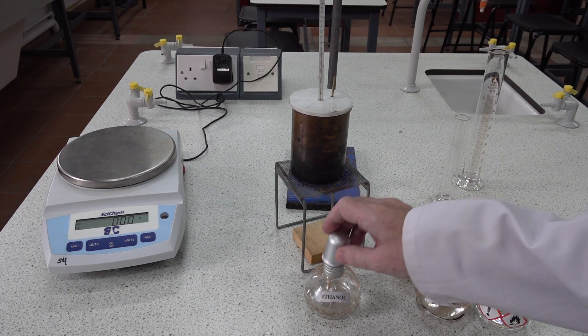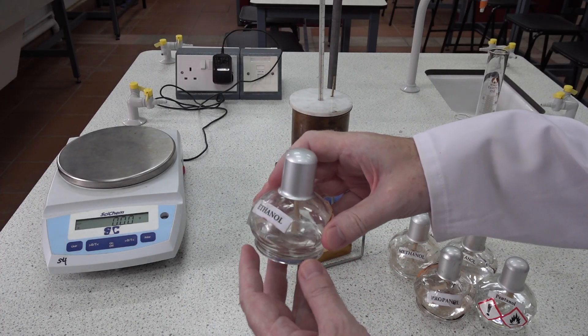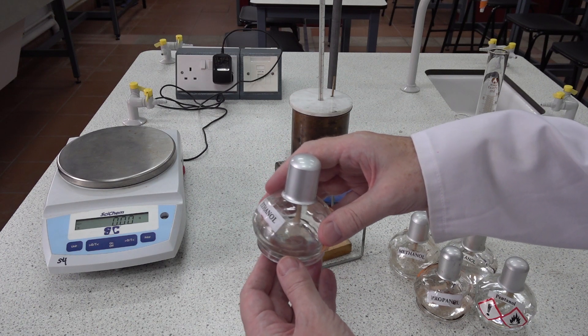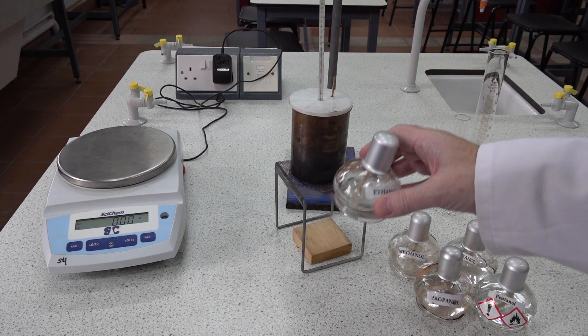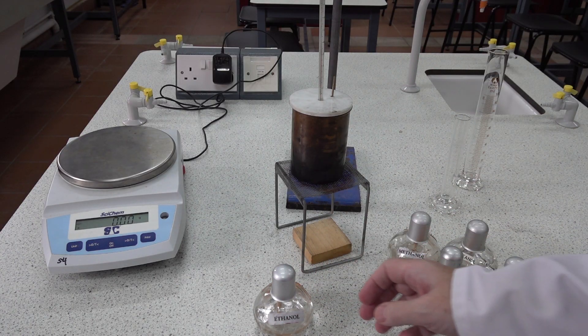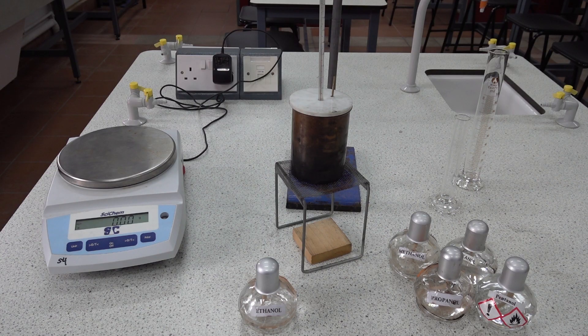Another large source of error is in the alcohol itself. Alcohols absorb water readily from the environment, so this will be wet alcohol that has water in it. The water will not burn, but it will evaporate off — it's completely miscible with the ethanol and will be drawn out through the wick and sent off as steam into the atmosphere. This means the recorded mass loss is not purely ethanol but also water, leading to a lower than expected result.